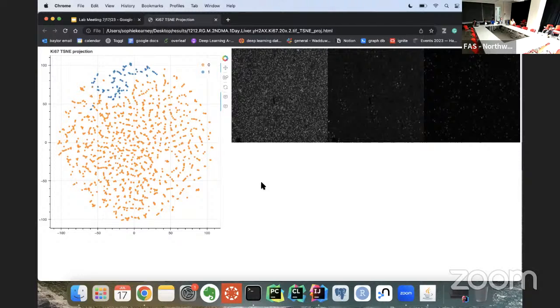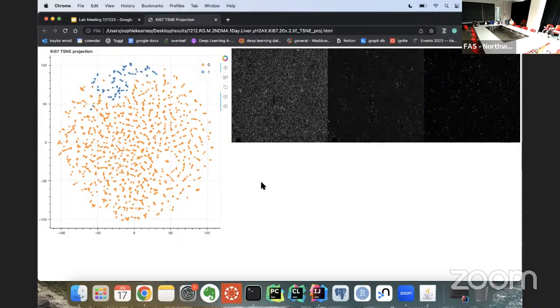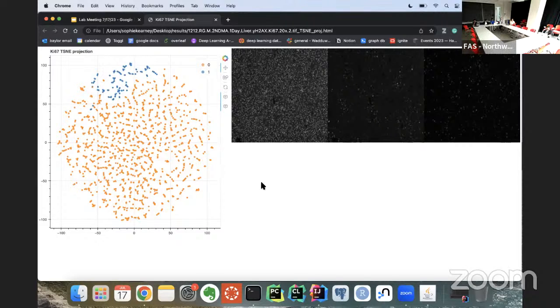For example, the image you are seeing has some 3,000 cells, and the t-SNE is shown on that image. In the bacteria data set it is already segmented and we only have single cell images. In that case, it's probably not a good data set.